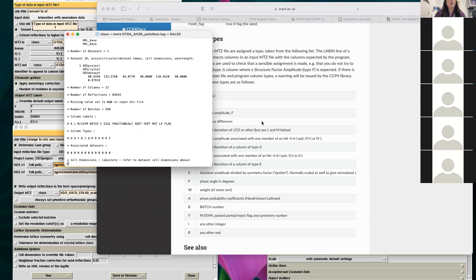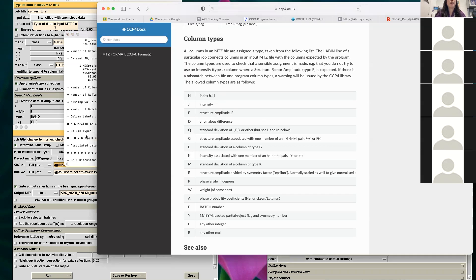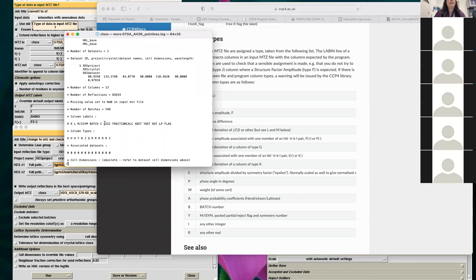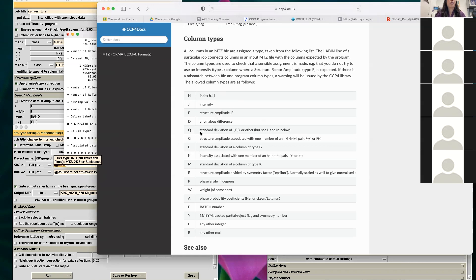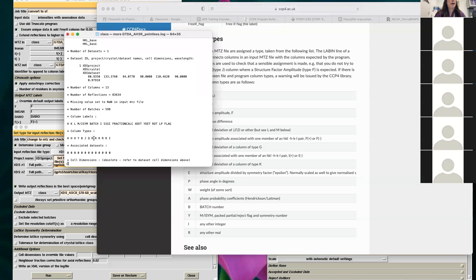Column type J is intensity — I, your intensity. Then SIGI, column type Q, is your standard deviation — how much error is in your intensity, or how significant is it. The R types are just real numbers — extra information XDS sends along that you don't have to keep. We'll talk about how you can manipulate MTZ files to retain the information you want and carry it from step to step.